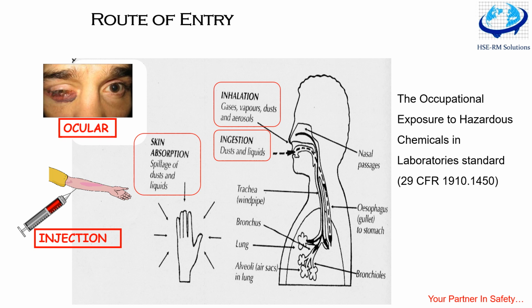You can refer to this standard and you'll get a lot of information. But what we are primarily going to highlight here is, when we are trying to tell people that it is unsafe, we must first explain how. So we must explain routes of entry. What are routes of entry? They are basically the ways chemicals can enter our body. Unless you understand this, you'll not be able to give the right crux of information that an individual needs to know, about why protecting these parts is important.